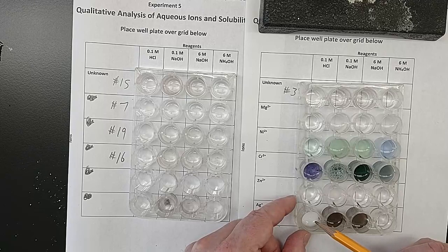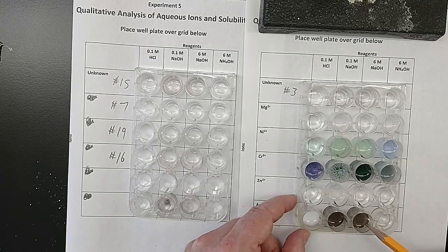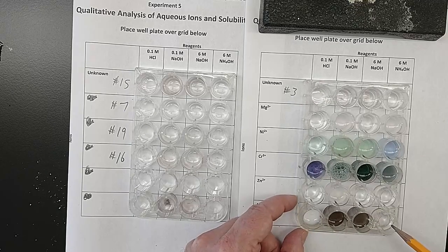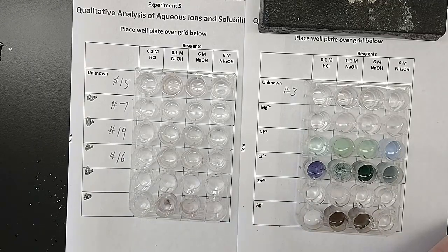Cloudy and white. Cloudy and brown. Cloudy and brown. Clear and colorless. Was clear and colorless to start with. Nothing in it.